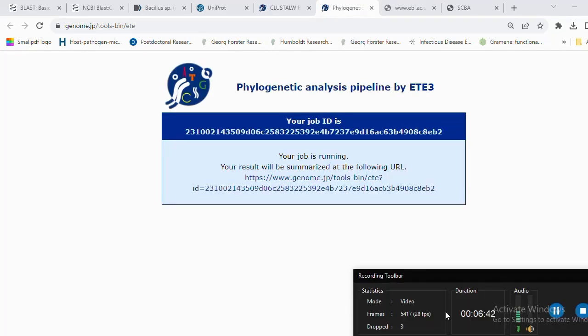While it's executing, let's look at the other results of the omega. Well, it's still loading, and we'll wait a little bit for it to load, and see if we'll get our results faster, depending on the network. So our result is loading. We have generated the multiple sequence alignment result. We used it to generate our phylogenetic tree. See, our phylogenetic tree is running.